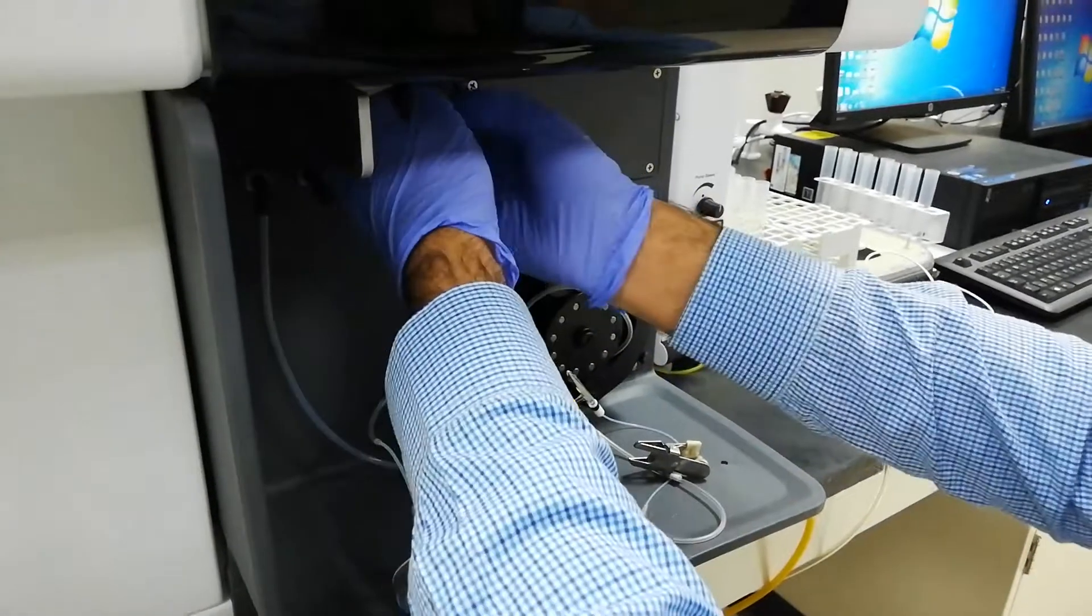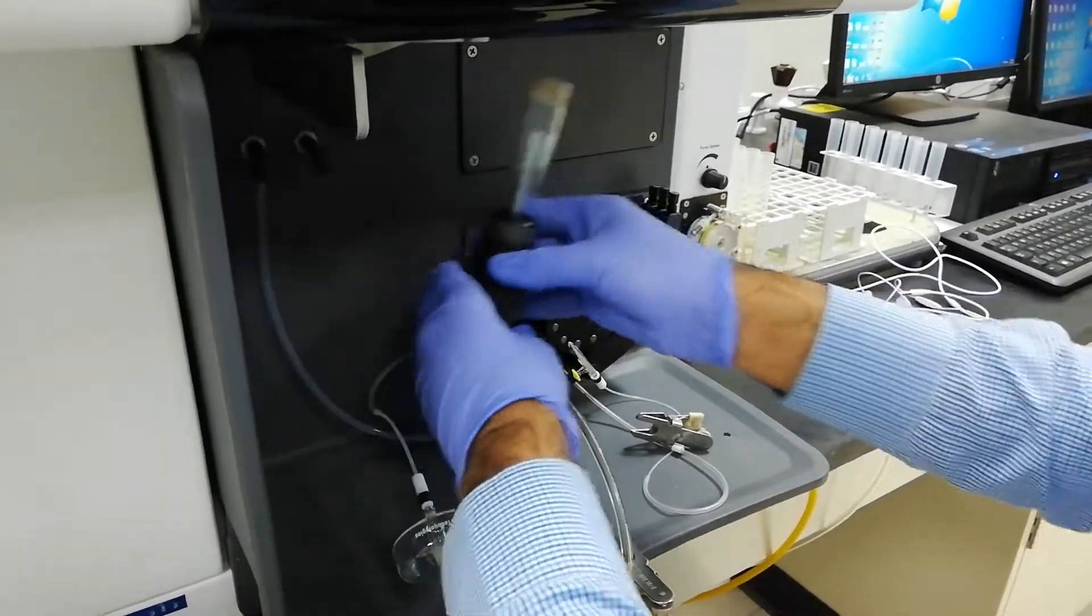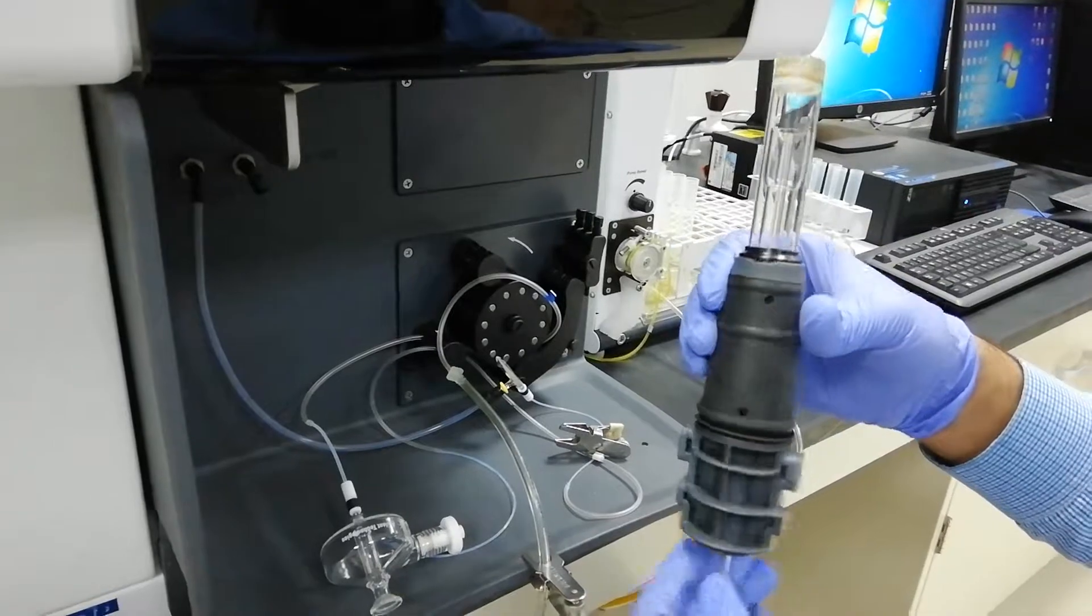This is the torch door. We have to open it and take it out. Currently, it is on the spray chamber. You can see that this is the torch.